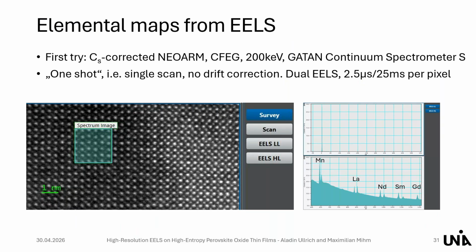The other question is, some elements show short range order behavior in the mapping. How can we confirm this is real or an artifact?